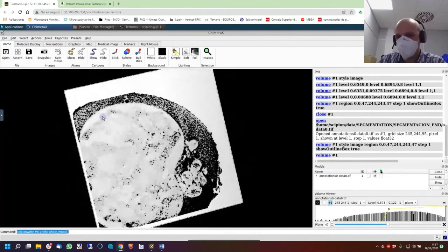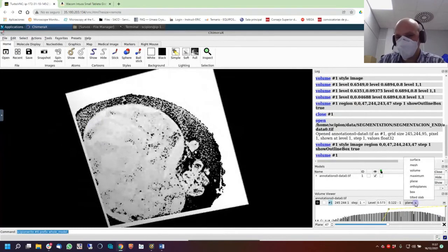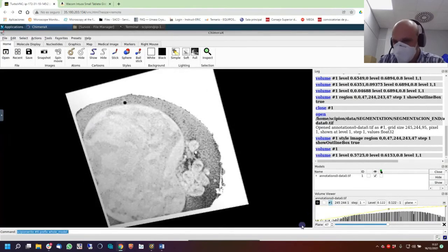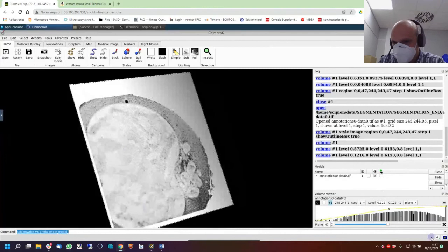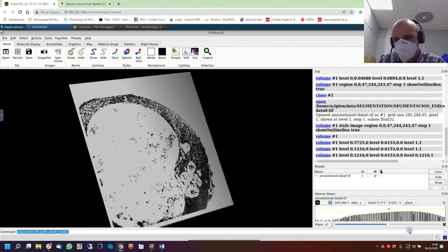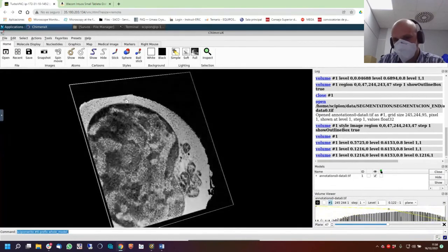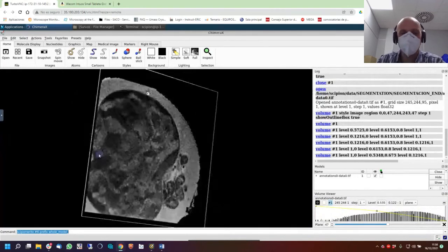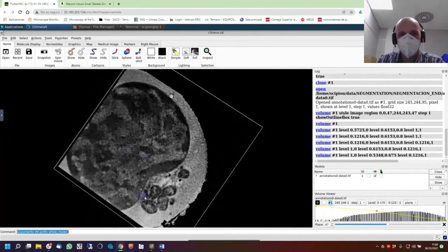Sorry for that. Here you have the value. You see now it's more normal. And even there is a trick. I don't know if it works here. If you invert the tips, you will be able to visualize in a normal way.